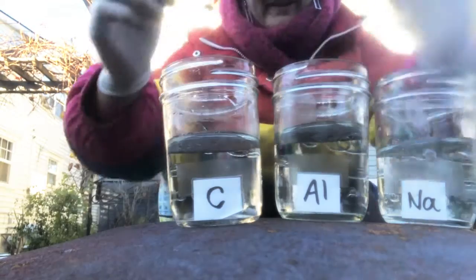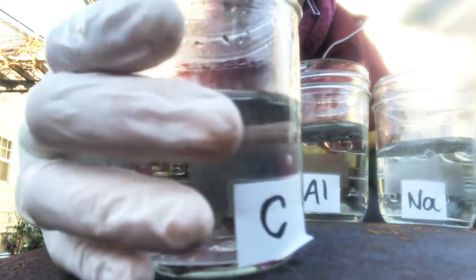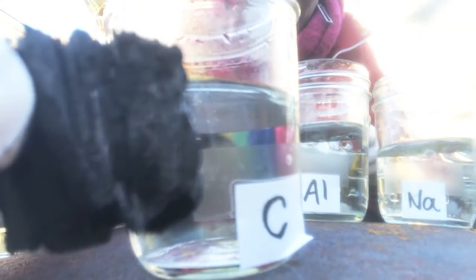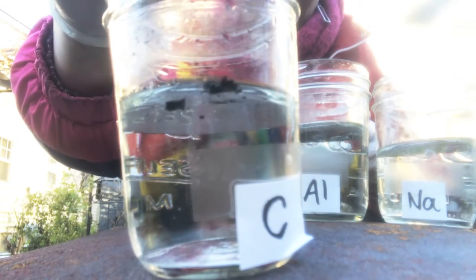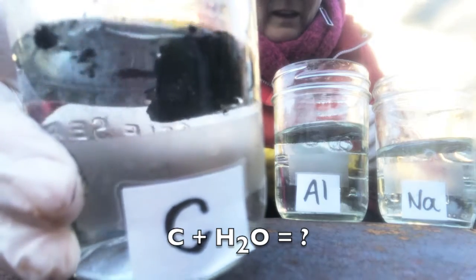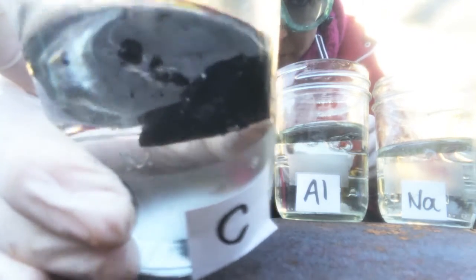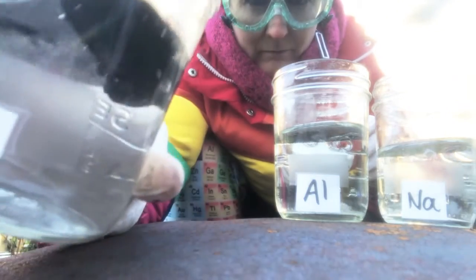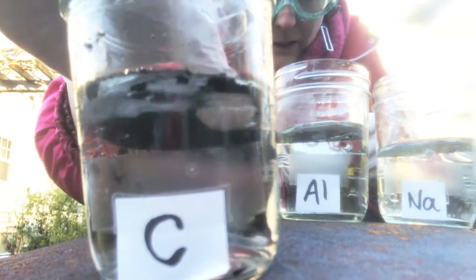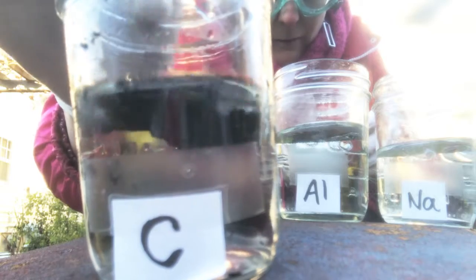And now we've got some carbon. So carbon, I got this right out of my fireplace today. Here's the water. So here we go, got the carbon. Just gonna drop it right in there. All right. Please notice there's no bubbling, nothing's happening. It's not getting warm. It's floating actually, meaning that it's less dense than the water, it's not mixing with the water.